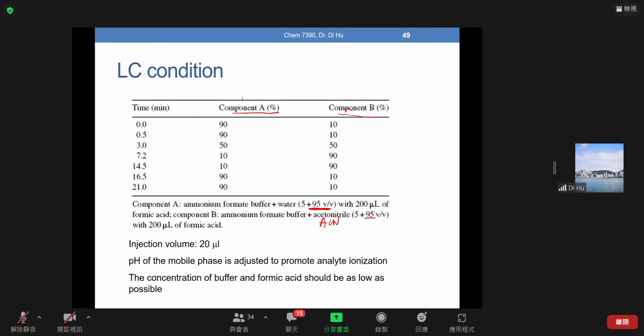So here I just want to mention one more thing. In reverse phase, although we say a range of organic solvents are suitable for use, actually only a few are used routinely. When we think about the organic phase, you just mentioned the solvent selection triangle. Yeah, that's true.